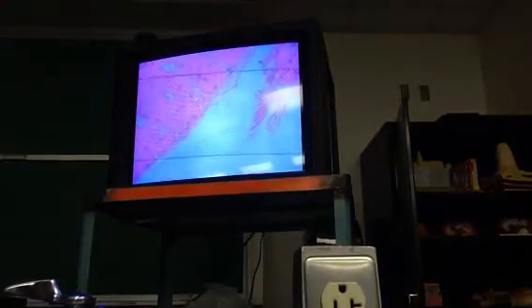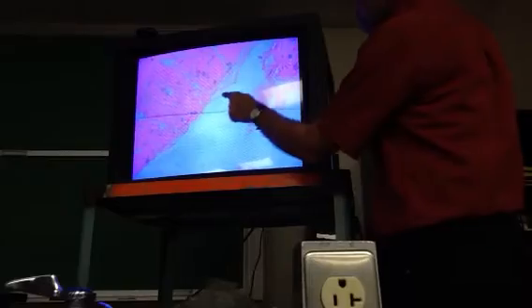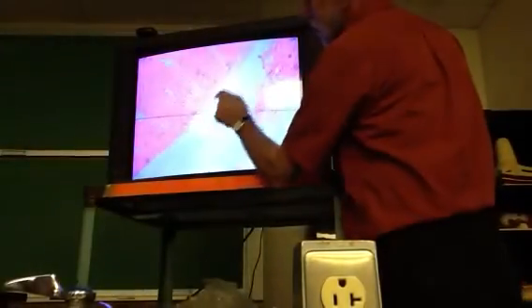Let's look at the outside edge of our longitudinal muscle layer, right down here. That doesn't have a special name. They're all myenteric plexus. Right here, that's your serosa. You get a glimpse of our serosa.